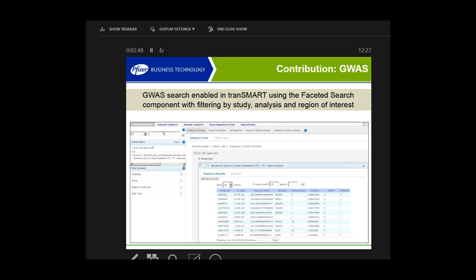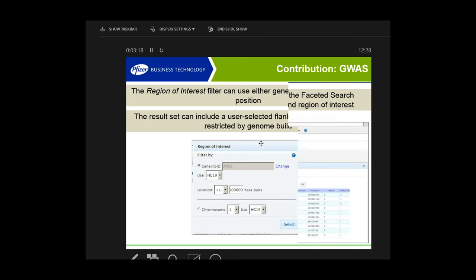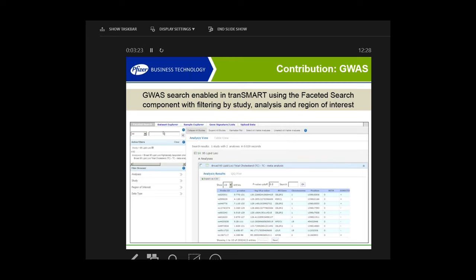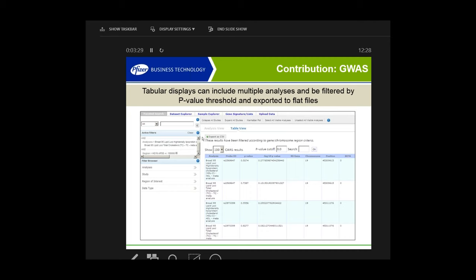You can pick a study of interest like the 95 lipid loci. You can pick one or more analyses of interest, or one or more studies of interest. For the region of interest, you can put in the name of a specific gene or a specific SNP plus the flanking region around that gene or SNP that you think would be pertinent. You can choose the human genome build, and when you select that it will become part of the filter and give you a similar tabular output. This allows you to look at multiple analyses on the same tabular output.